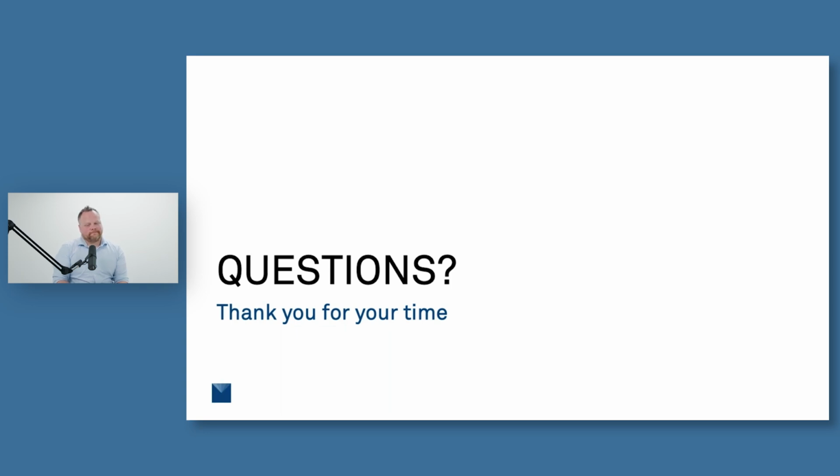All right, we're getting close to the end of our time here. There was another question asking about frozen samples. That would go into that same consideration with drilling pilot holes and thermal grease. There are a couple of questions asking about the temperature sensor itself. Can you describe how it works? Is it a single needle, dual needle? Those kinds of considerations.